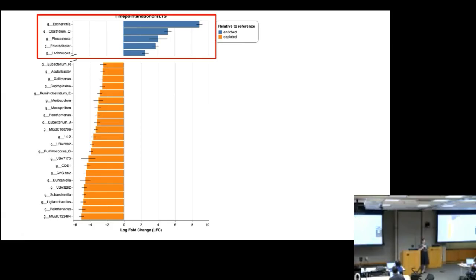Sampling is a representation of the gut microbiome, and sequencing is a representation of that. So there are so many levels of abstraction in between what we're actually seeing, and that's definitely important. I always think about that when I'm looking at donor indicator species. We see these in the donors, we're not seeing them in the recipient, but there is a chance they were always in the recipient.